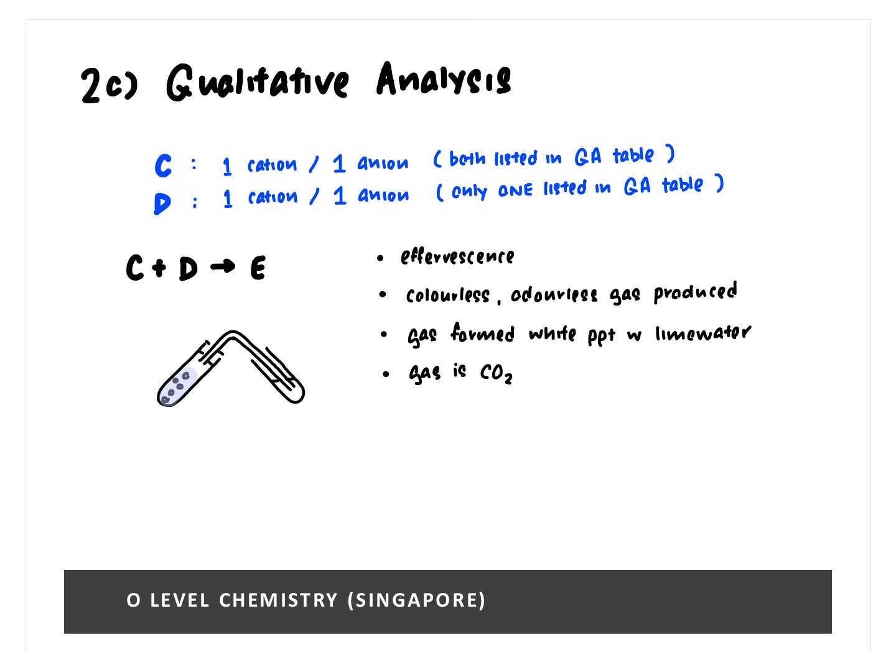The last experiment is a QA experiment. Again, QA do not come more simpler than that. Okay, the first part of the QA, you're supposed to mix C and D. C is a white powder. And for those of you who were alert enough, you would have guessed that it's zinc carbonate.